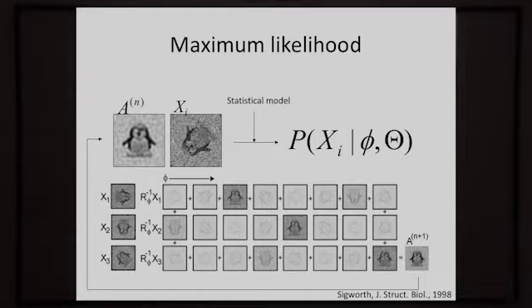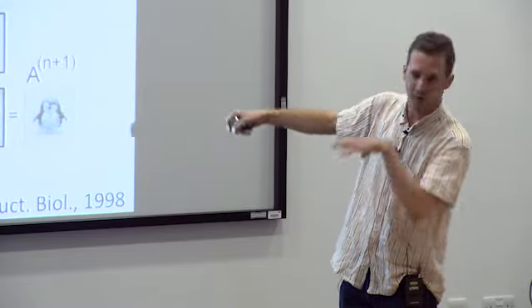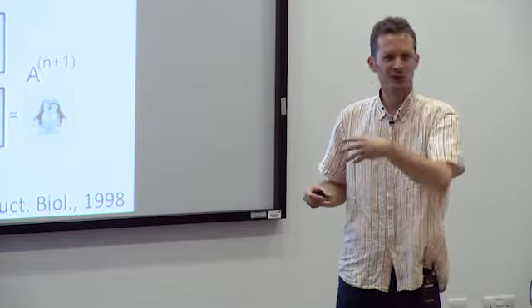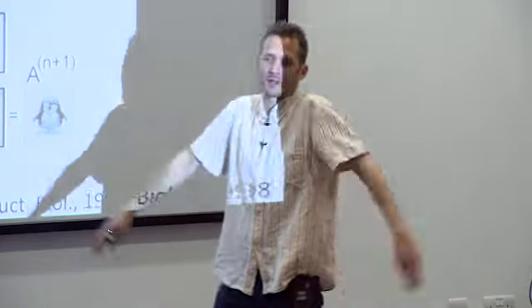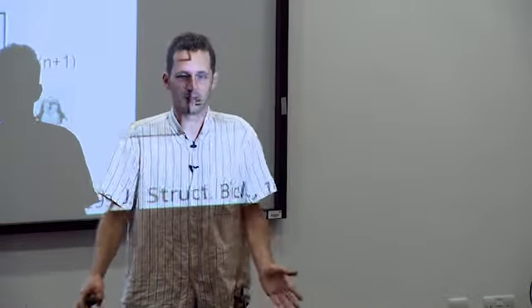That's why it's very whitish here. This would be 45 degrees, very low. At 90 degrees, I'm actually at the right orientation. The squared difference with this reference image will be small and the probability will be high. That's why you can see it here. And then you rotate it back again. Perhaps when you're at the upside down orientation, to some extent a penguin, if you clip off its wings and you don't look at its eyes, you can put it pretty well upside down into the reference.